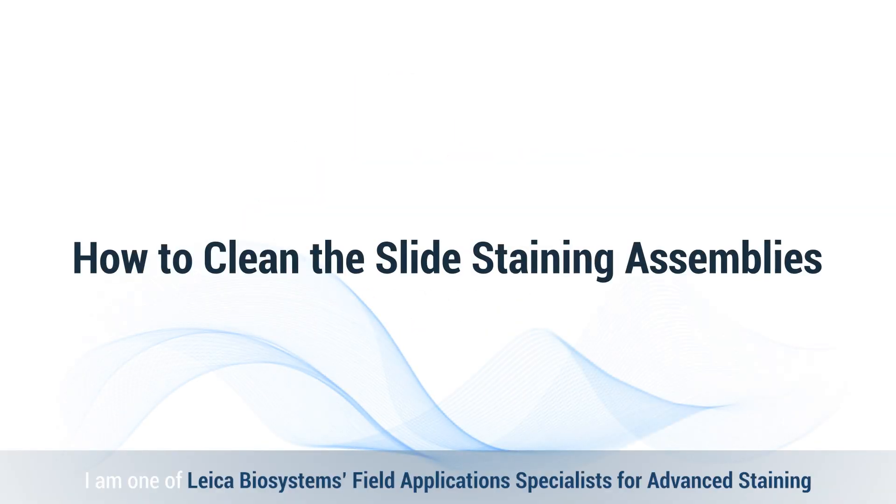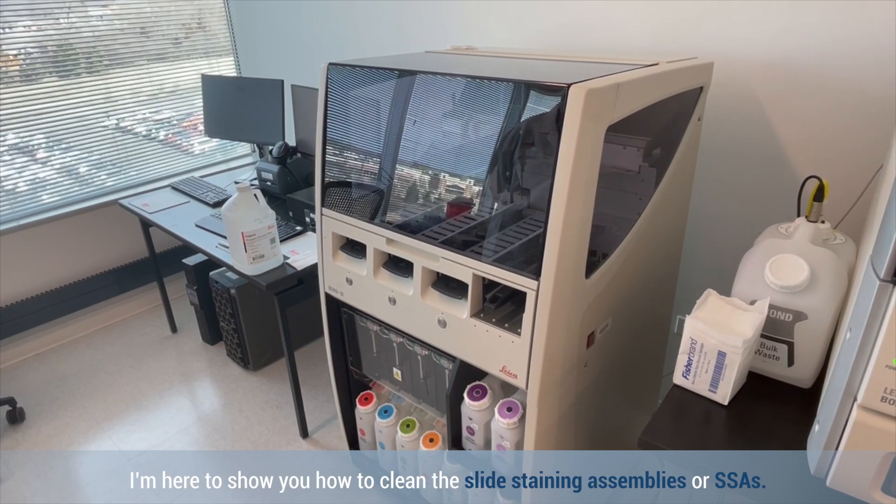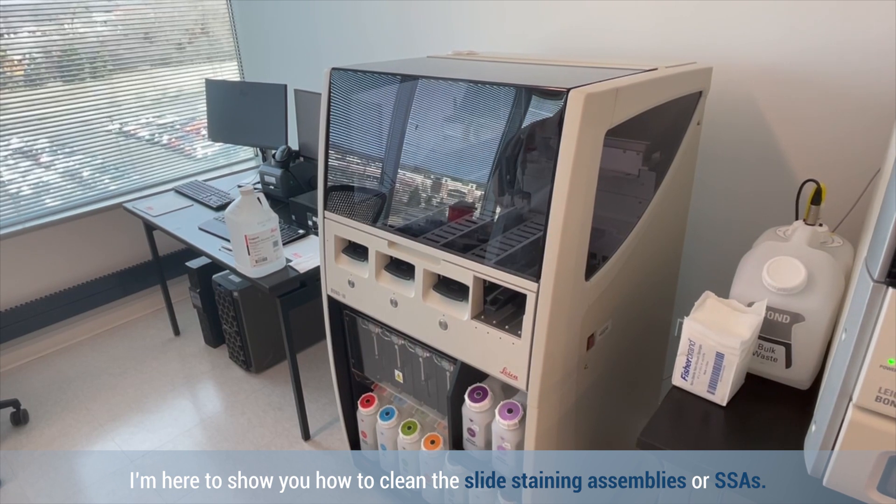Hello, I'm one of Leica Biosystems Field Application Specialists for Advanced Staining. I'm here to show you how to clean the slide staining assemblies, or SSAs.